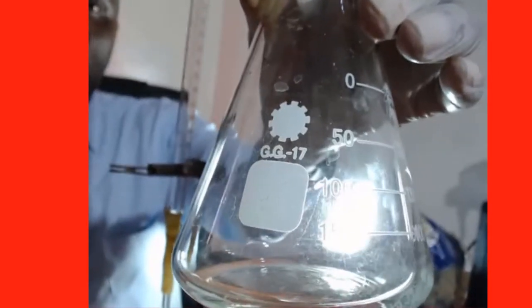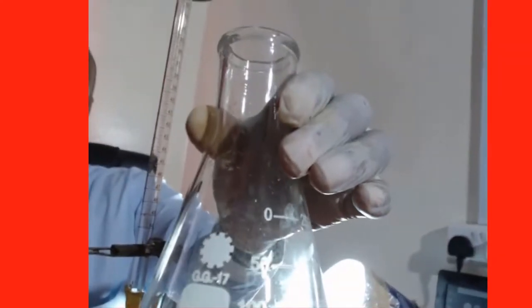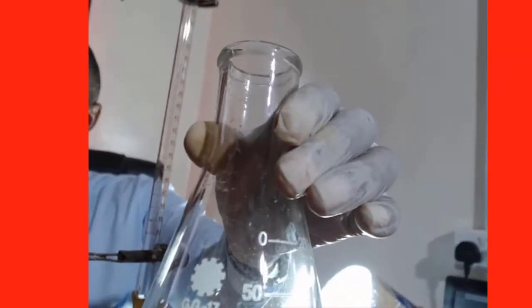So let us go. The first step is we are going to put the solution of sodium hydroxide here, and then we put phenolphthalein indicator. Right now, I don't want to use the pipette filler, so I'm going to suck it up. I put it in this flask.